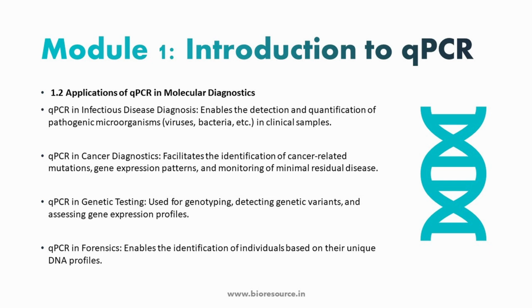So the level of mRNA can be analyzed, whether upregulation or downregulation, and the effect of treatment can be monitored using qPCR. One of the classical examples is the use of qPCR for monitoring chronic myeloid leukemia, where the BCR-ABL transcript can be monitored during the course of therapy and provides information on the reduction of disease burden or the mutation burden in the patients.